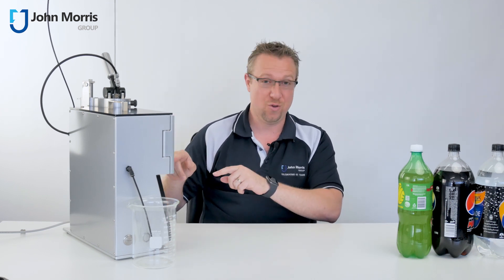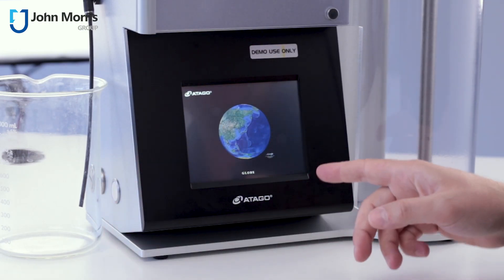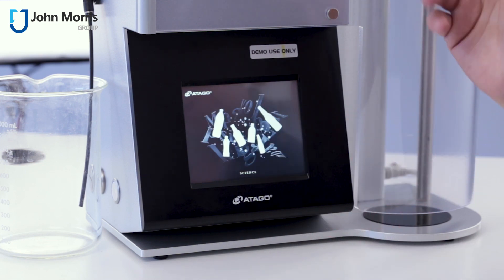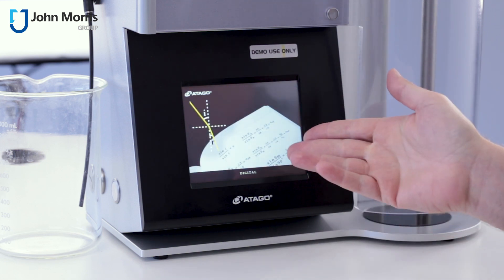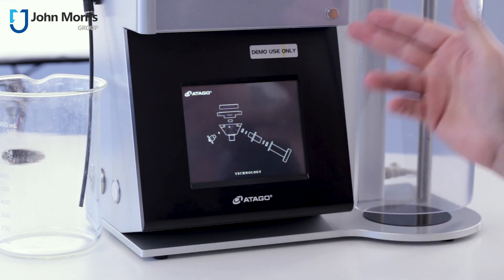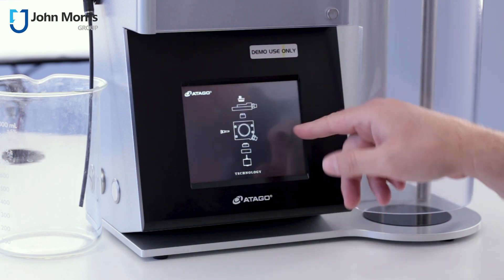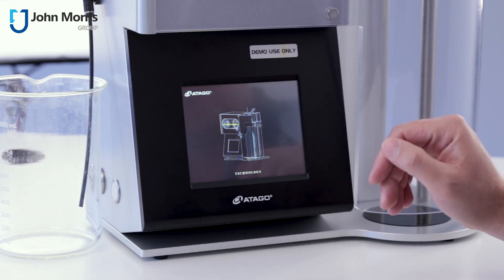Watch this when I turn this thing on. The Japanese — I don't know what they were thinking, but I love it. I don't know what the relevance is of the globe or the light or the party. Who needs this? But cute. Now you can turn this off after it's actually loaded, so you don't have to watch this every single time.